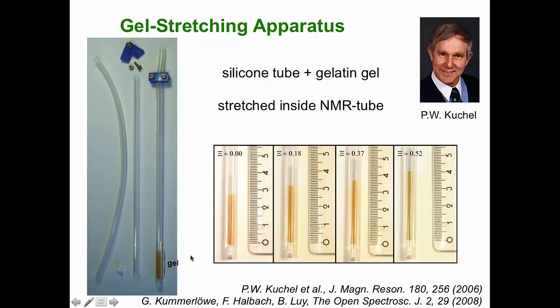Well, you know, if you are confident and you want to do it, but you have to be aware that there is a stopper here, and then there is maybe a risk of the sample dropping inside the probe. I haven't heard any accidents, but I know that many NMR managers will not like or will panic if they see a user, me included, walking into the room with a tube that is open at the bottom.